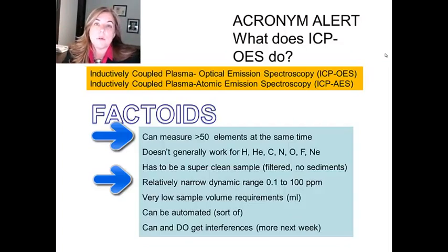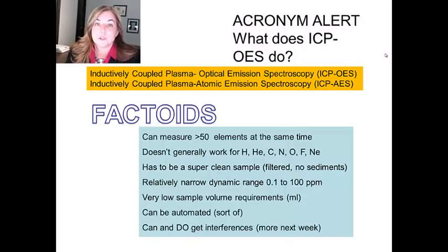The other thing I'd want you to know about it is that it's got a pretty good detection limit. We're going to talk more about detection limits in the next few lectures, but it's a good, solid spectroscopy, except you need a pretty clean sample to work with. It will be more expensive than AAS, as you'll see.